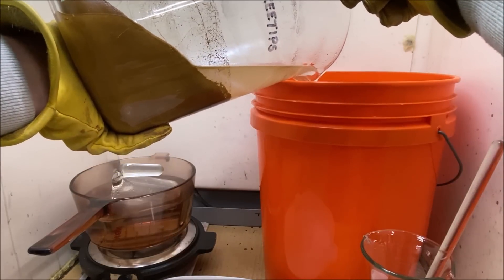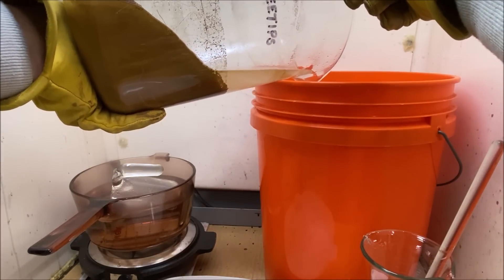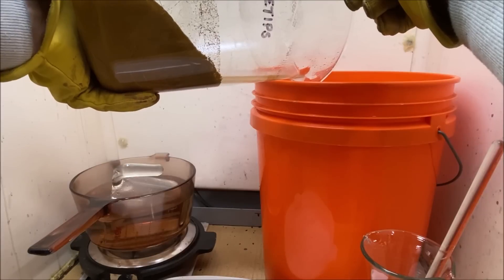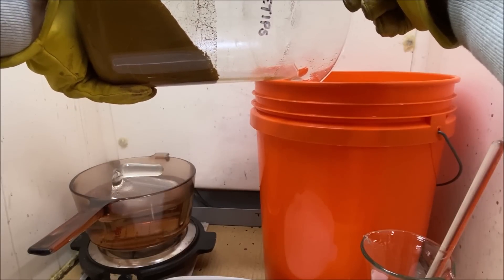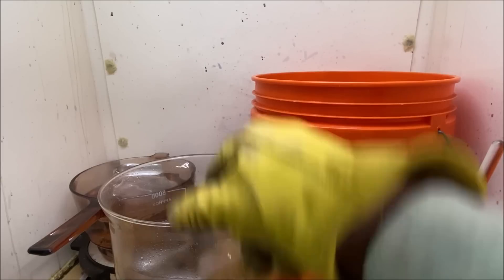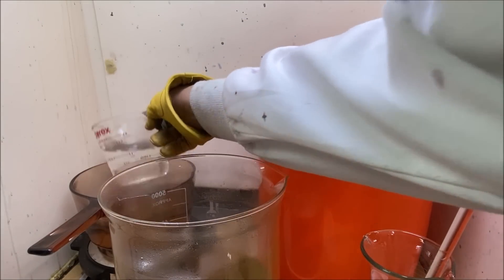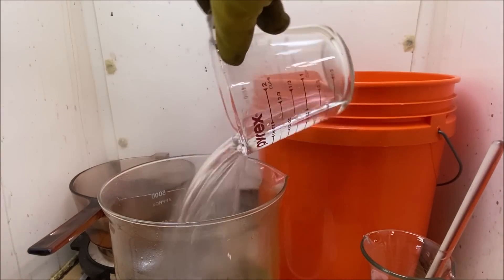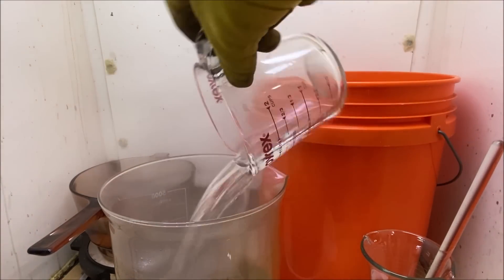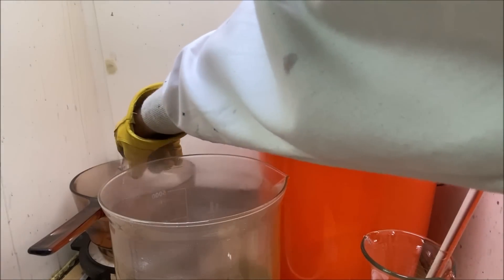A little bit of the gold might get poured over with it, but that's quite all right — we'll recover any gold that gets poured over. I'm going to continue to rinse this over and over until I get all the excess SMB rinsed off.